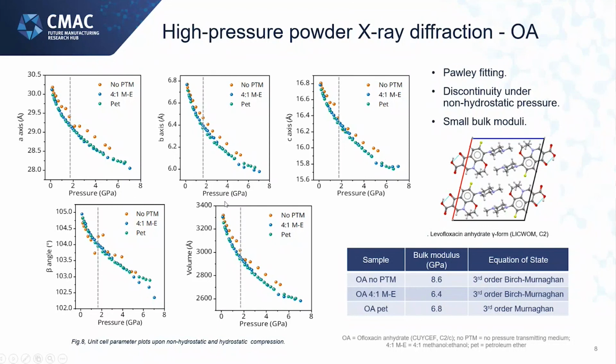To see a bit more of the fracturing and the change in the size of the particles, I think, for example, using terahertz spectroscopy or another technique might be a bit better to give us a good understanding of this. I'm hoping to complement this in the future with more compaction studies of making tablets and then analyzing them with terahertz. And then we can see when these voids are changing. We can also, for example, get a particle size distribution and see how it has changed under pressure. So I think we would need experiments like that to give a better understanding of this.